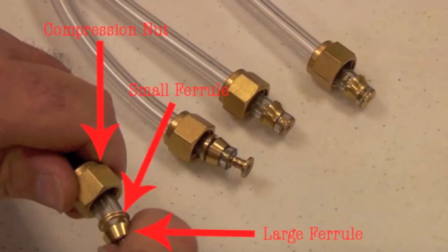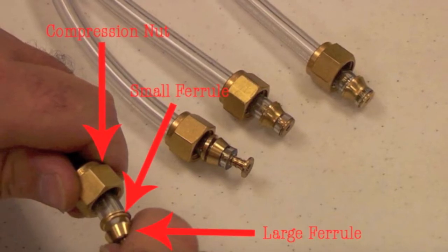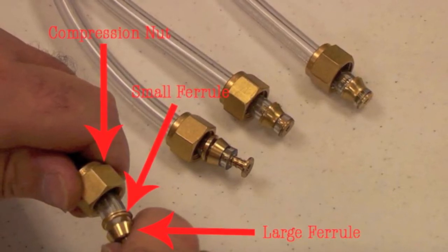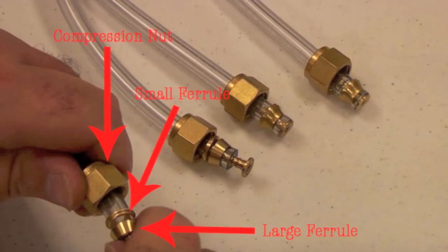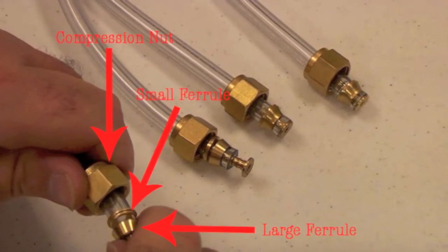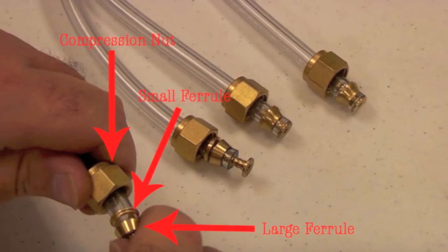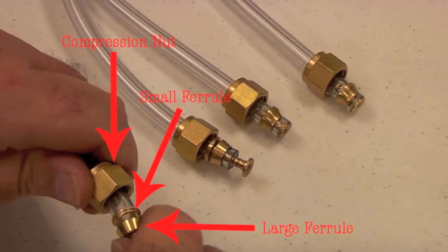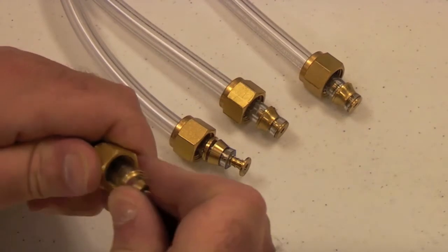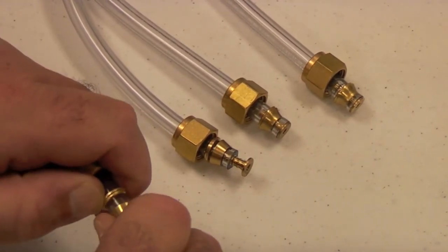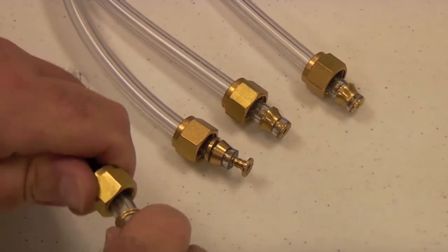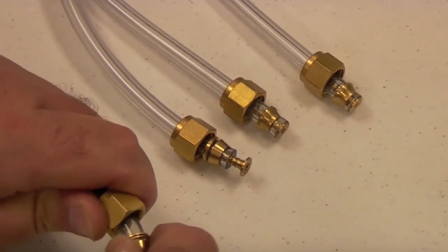The Swagelok compression fittings should be assembled on each cut tube end for connection to the electric solenoid valves. The order of the three-piece Swagelok fitting assembly is as follows: 3/8 inch compression nut, small ferrule, and large ferrule. Note that both ferrules should be placed with the smaller diameter facing the end of the cut tube. Push the three pieces a quarter of an inch onto the tubing.